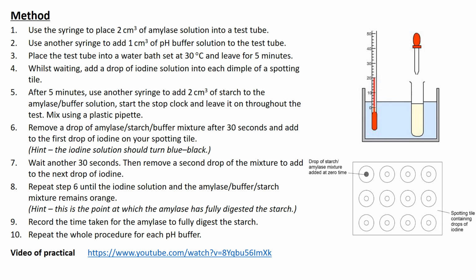Now this can be open to perception, and it is really important that you stir your solution. Sometimes in science we can use an electric stirrer to ensure that happens. Okay, so here's the link to the practical so you can watch it online. It can be done with lots of other enzymes. The other one that they're quite interested in is pepsin, which we find in the stomach, and they're quite interested in whether or not you understand the same principle but apply it to a different enzyme.